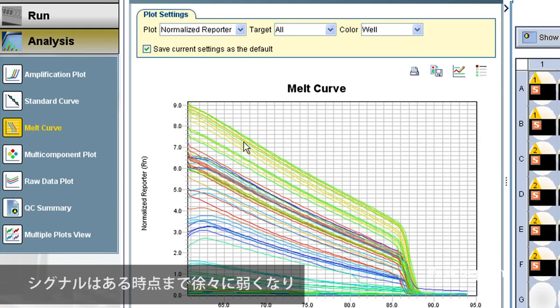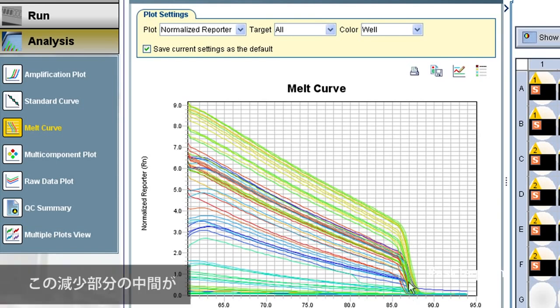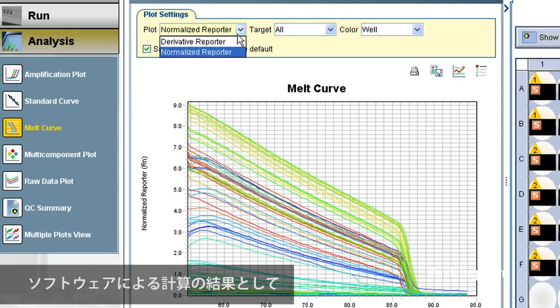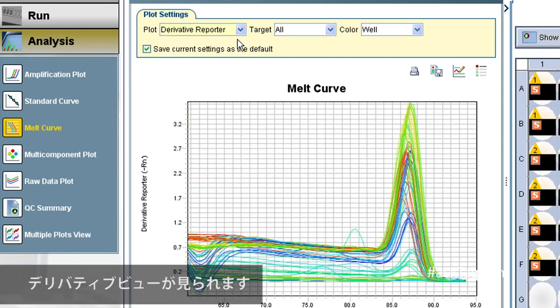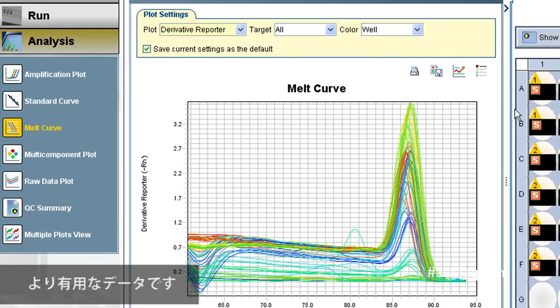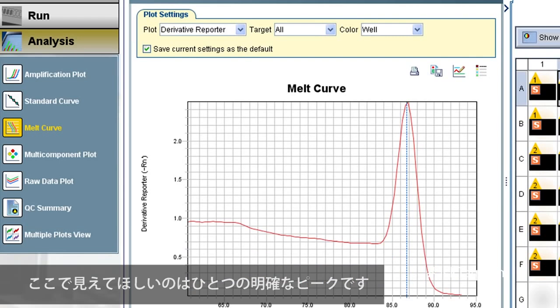The signal drops slowly until at some point it drops off suddenly to zero. Halfway down this drop-off is the presumed melting temperature of the product created during PCR. If you choose the derivative view from the drop-down menu, the drop-off gets converted into a peak.